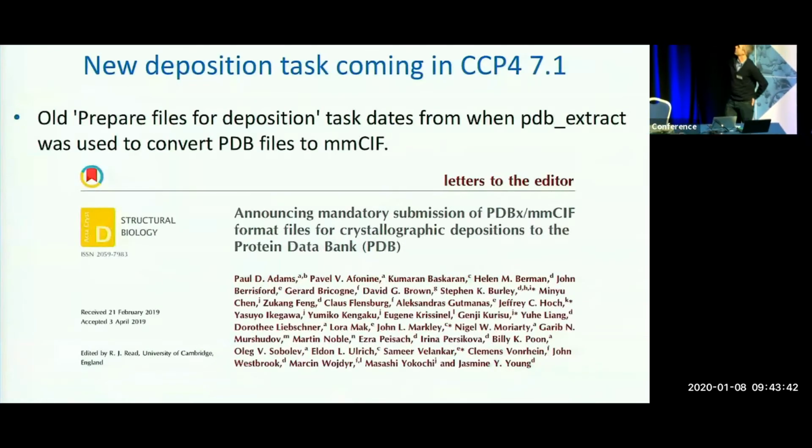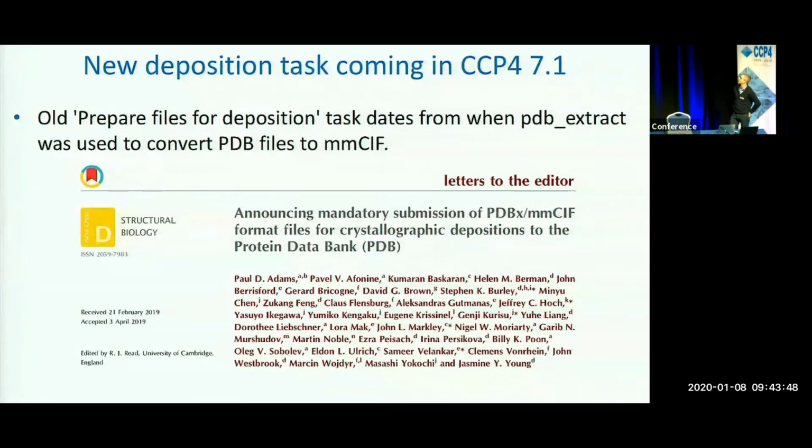So CCP4i2 has always had a dedicated deposition task. The old one, which was called Prepare Files for Deposition, dates back to the days when PDB extract was used to turn the PDB files that came out of refinement into mmCIF format for deposition in the PDB.